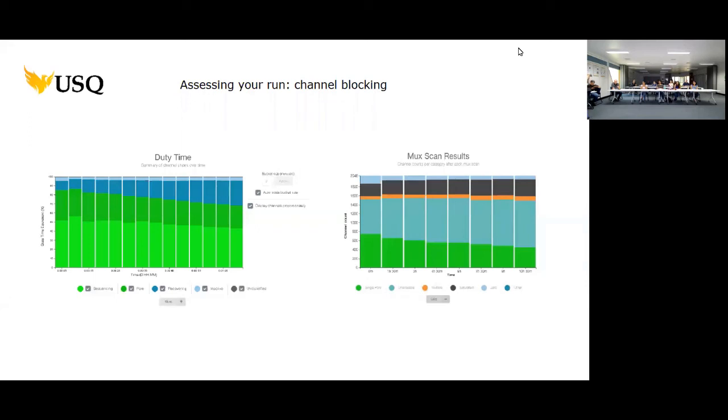After a period of time, if it cannot recover itself, it'll just turn itself off and become inactive. That's what you will see further down the track, that dark blue turning to light blue, becoming inactive. So this is a really short sequencing run, less than an hour, and you're just seeing more and more pores trying to recover themselves. This is an impure DNA sample with lots of contaminants, and they've blocked up, or are starting to block up, all the pores. If you see this, you want to stop, go back and try and purify your sample further.